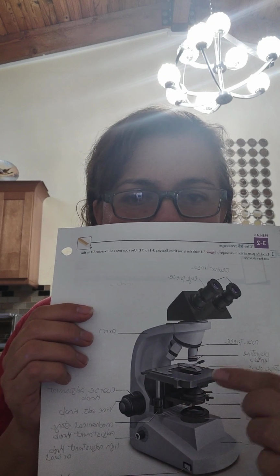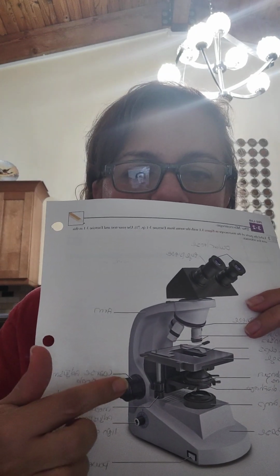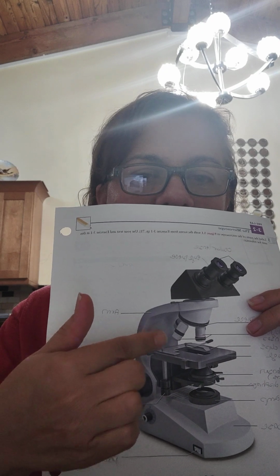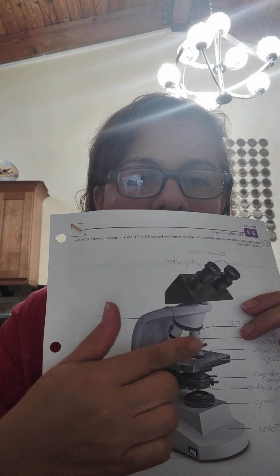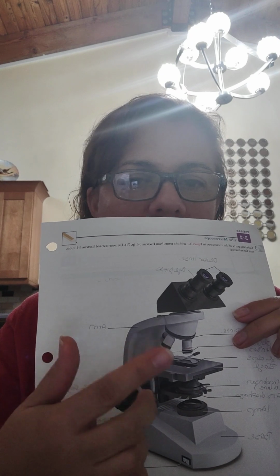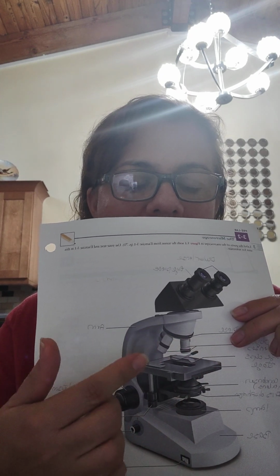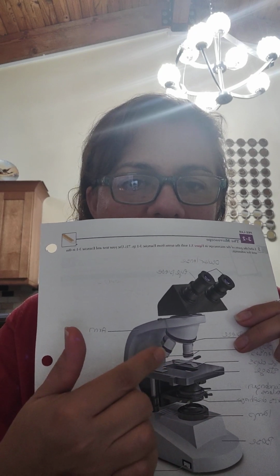firm in place. Now the second one I'm going to talk about is the coarse adjustment knob, this one right here. So what this one's going to do, you're going to be able to move the stage up and down, bring it up according to the objective lens that you're using. You're going to first find it in the lowest setting, like for example 4 or 10, and then you're going to move and change the objective lens.